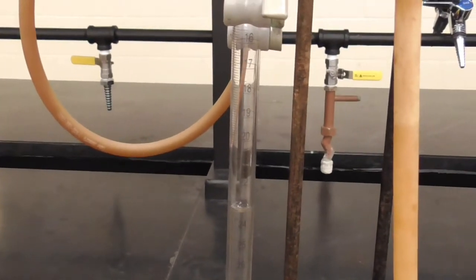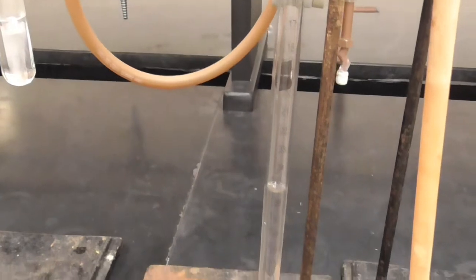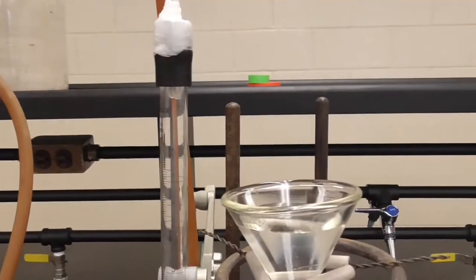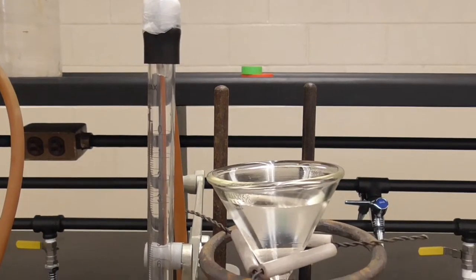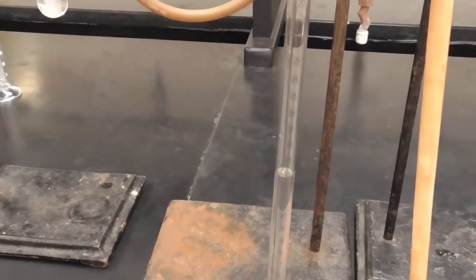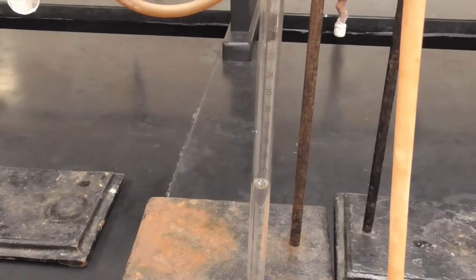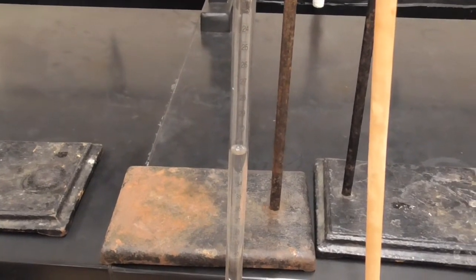So what's going to happen is that the hydrogen is going to continue to push the water out of the burette. If we look at what has happened in the funnel, of course the level in the funnel has risen as the water comes out of the burette and up into the leveling bulb, which is the funnel. When this reaction finishes, then we will need to re-level the leveling bulb with the meniscus in the burette.